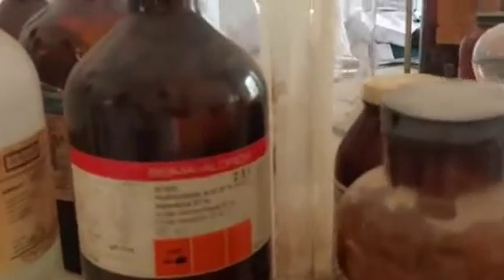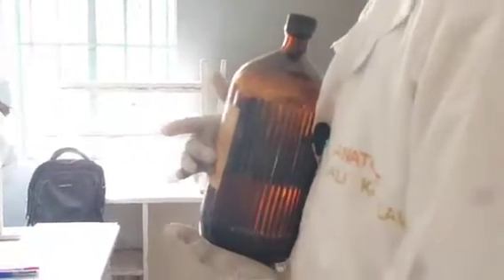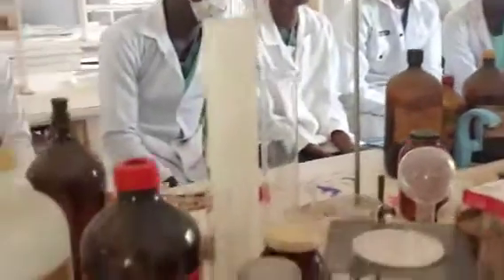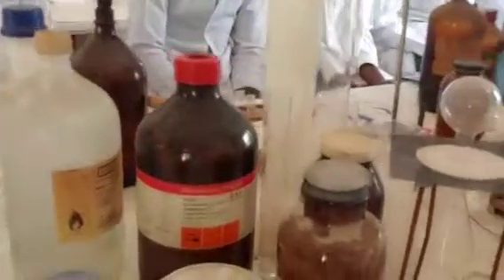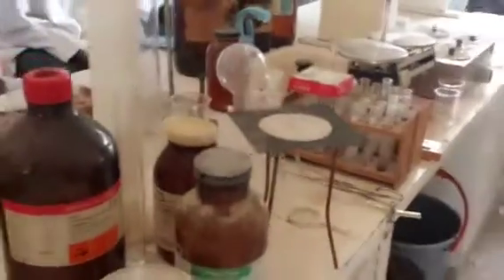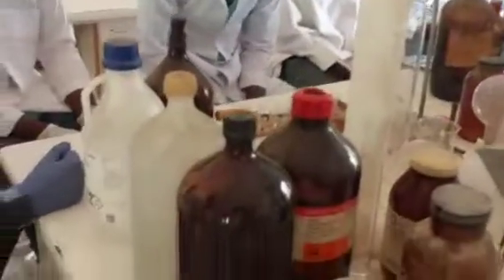And you see some different labelings. Like this one is ethanol. You will see it is just written harmful and flammable. It doesn't have that skeleton whatsoever, because that is saying that this is more hazardous than this. Even this one is harmful, but this is more hazardous than the ethanol. Is that understood?